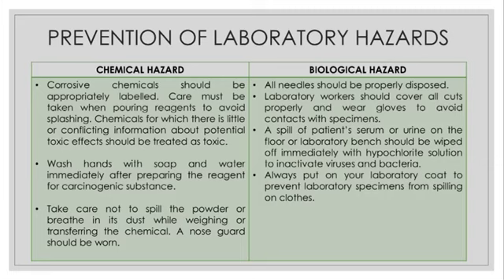Wash hands with soap and water immediately after preparing the reagent for carcinogenic substances. Take care not to spill the powder or breathe in its dust while weighing or transferring the chemical. A nose guard should be worn.